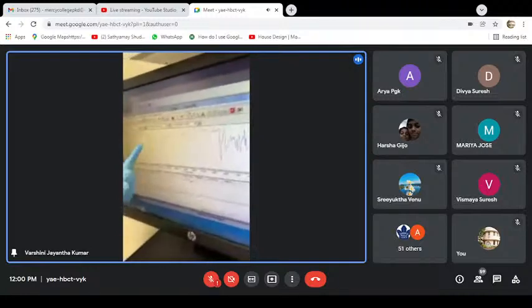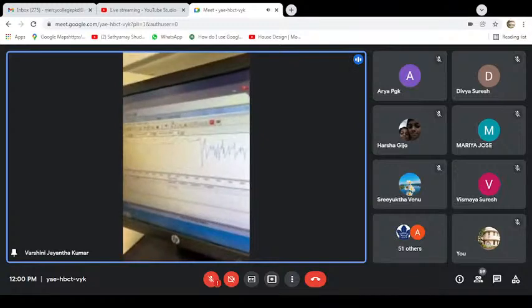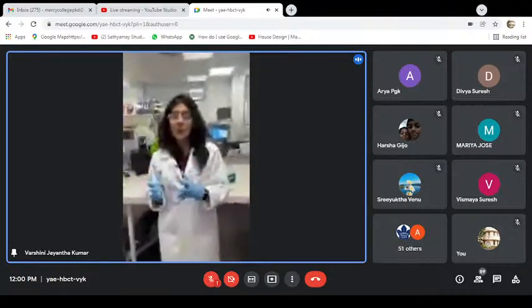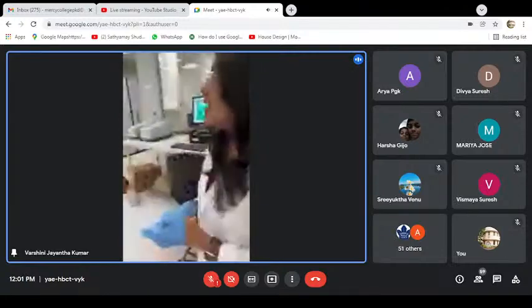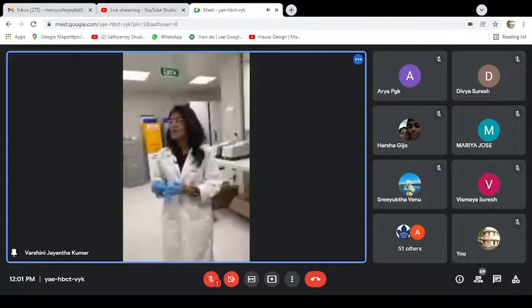And a band around 3400 to 3000 in this region will correspond to an acetylenic band, which is C triple bond CH. So we can understand whether the molecule is actually the one that we were aiming for. And this is one of the methods that we use for that. And now, I think that's pretty much it, right? Do we have anything else?